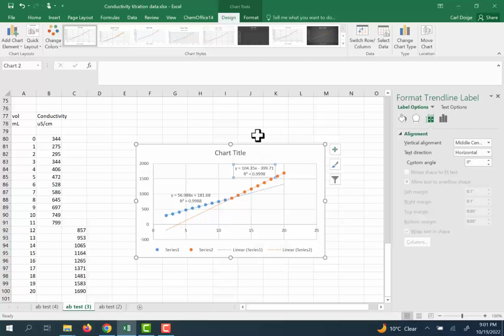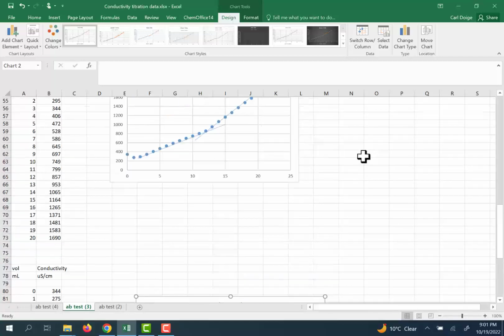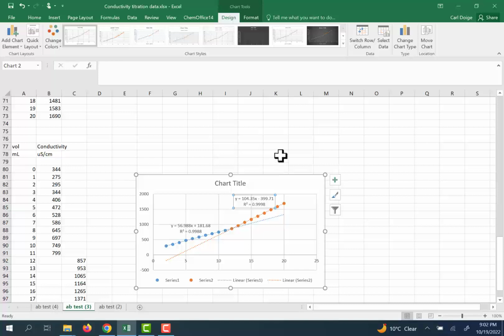Again, in terms of your report, you'll need to do this process 3 times, or at least as many times as you did the conductometric titration. But in terms of what you report in your report sheet, I'm just going to close this window right here, we need to see this graph properly formatted, and one copy of this graph properly formatted. If you also did the calculation for 2 other conductometric titrations, you need to do the calculations, but we do not need to see those graphs.